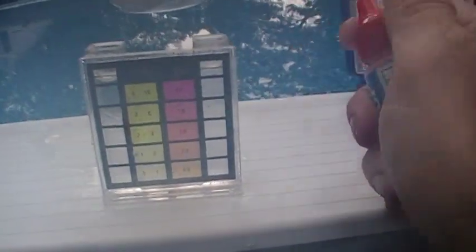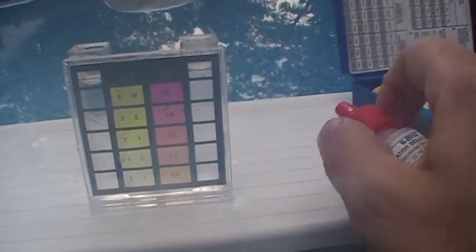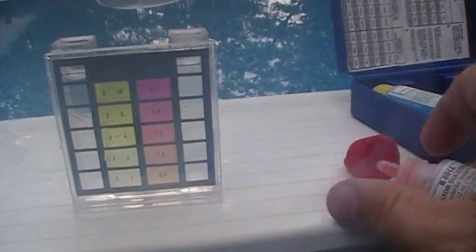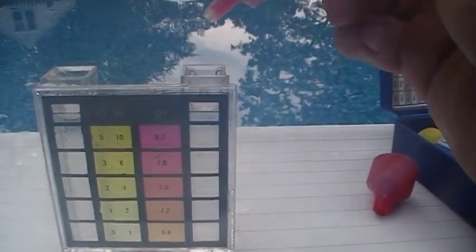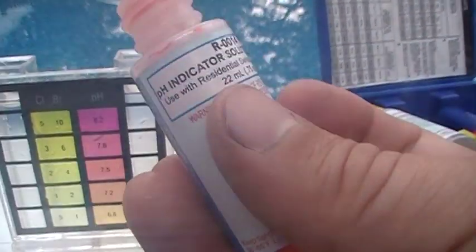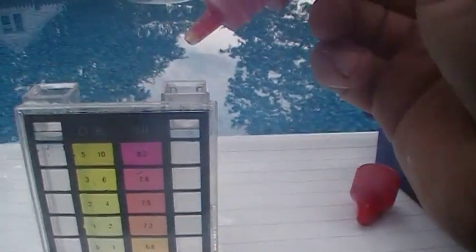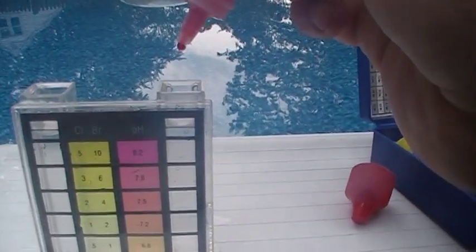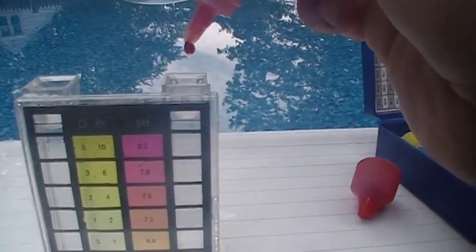This kit tells you to do five drops of each. You're going to add in the pH - the red ones are the pH, which is this bottle. Most of them will have instructions to tell you how many drops; this one happens to be five.